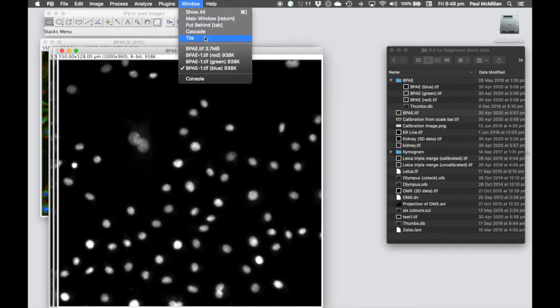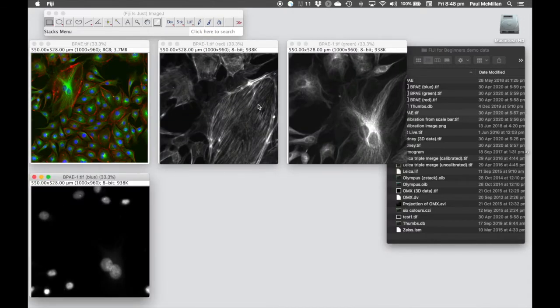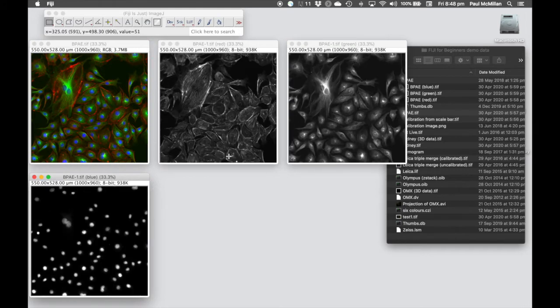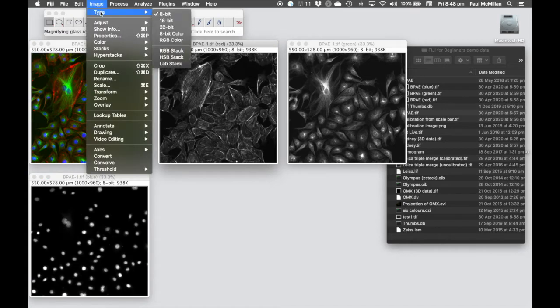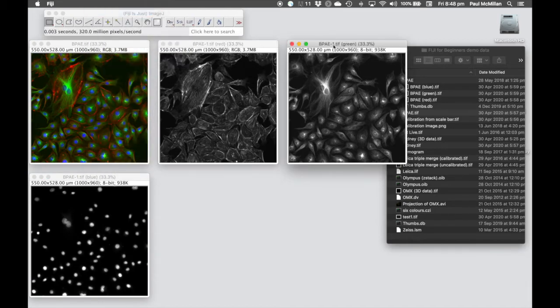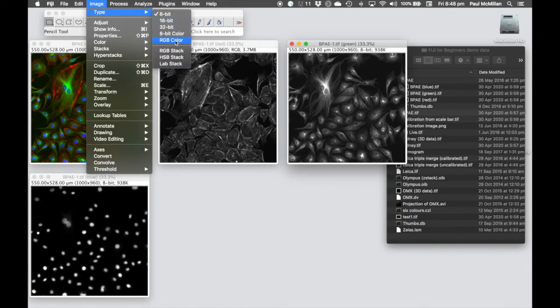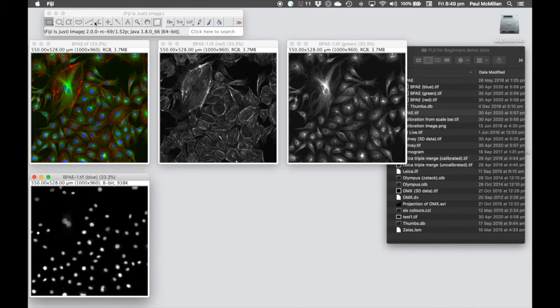We generate the individual panels by splitting the RGB image. Go to Image, Color, Split Channels. This gives us four different images to use to build the panel. We could assign lookup tables to give them individual colors, but grayscale is a good way to present individual channel information. We'll keep the data as grayscale but convert them from 8-bit into RGB images, then do that for each channel.